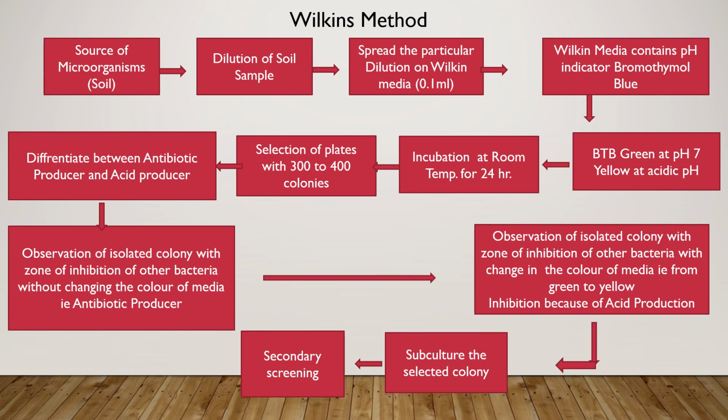Secondary screening will provide us detailed information regarding the selected organism, as well as the nature of the antibiotic, whether it is a broad spectrum antibiotic or a narrow spectrum antibiotic. Thus this Wilkins method helps us to overcome the disadvantage of the crowded plate technique. Thank you.